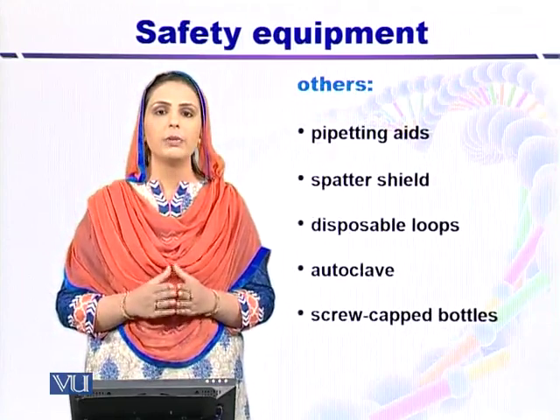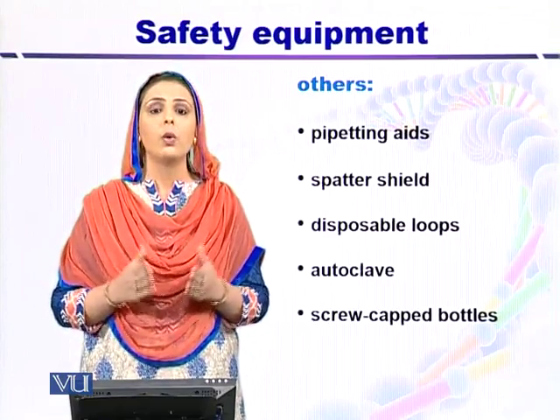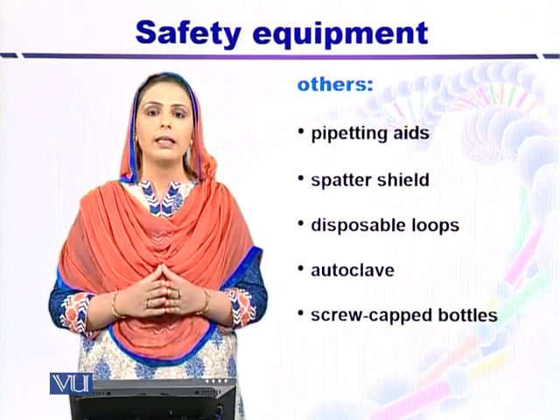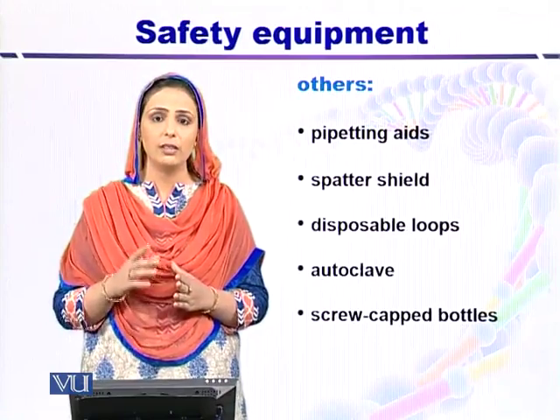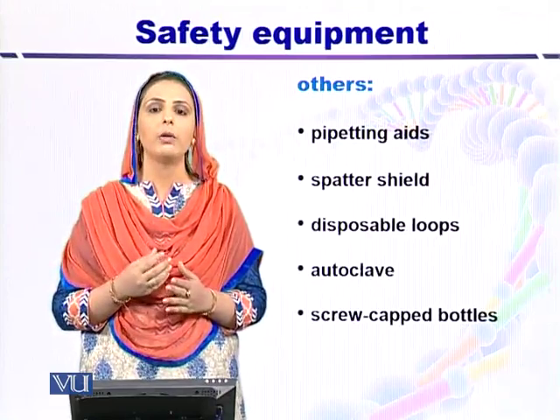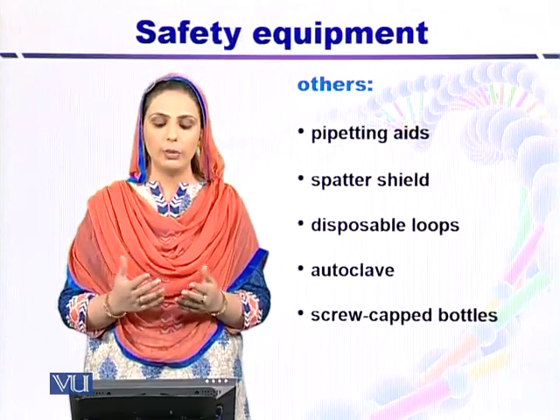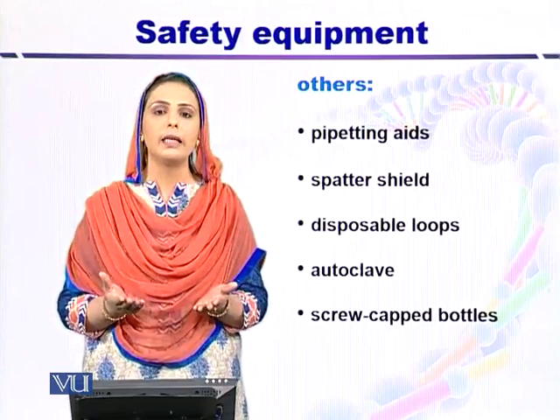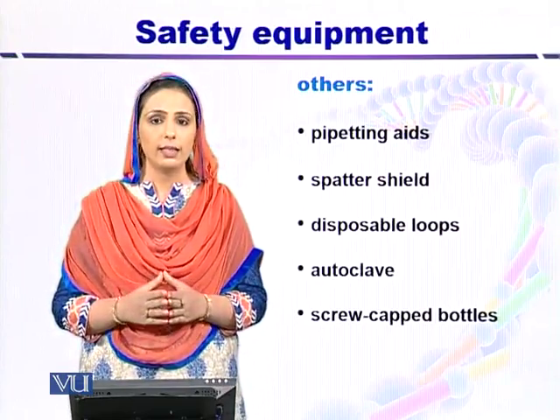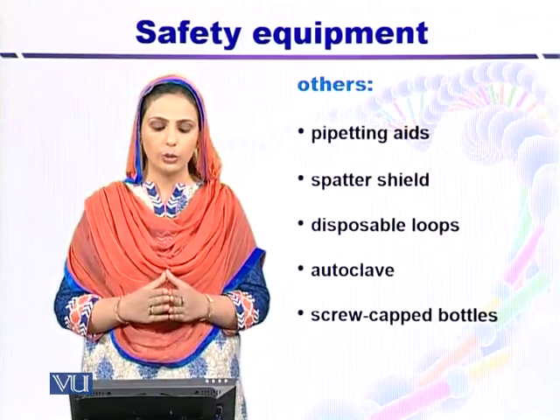Other safety equipments which are routinely used in the labs are pipetting aids, as the World Health Organization has totally prohibited mouth pipetting. For example, if we put our hand at the suction site, then it can contaminate our hands and we can put it into our mouth, as a result of which pathogens can enter into our GIT tract and cause various problems. So it is better to use pipetting aids at the tip of the pipette to suck even toxic chemicals. And the interesting thing is that these pipetting aids are autoclavable.